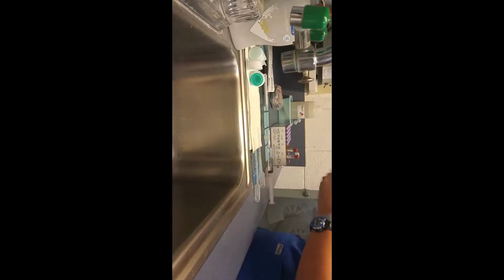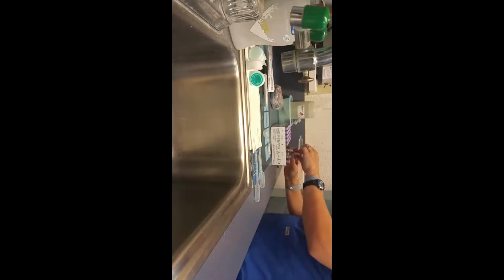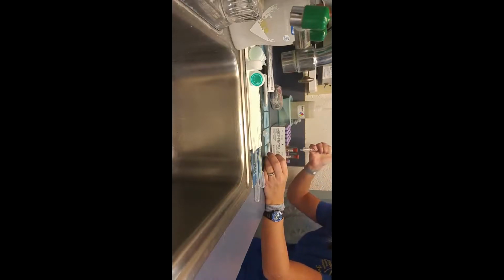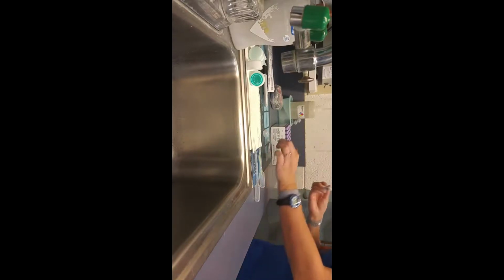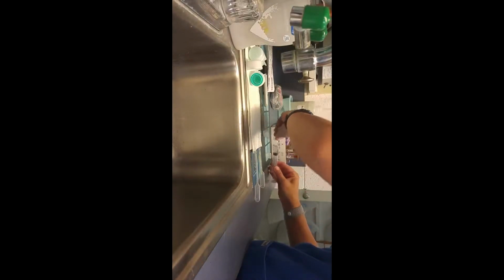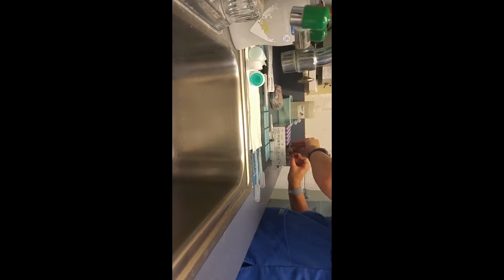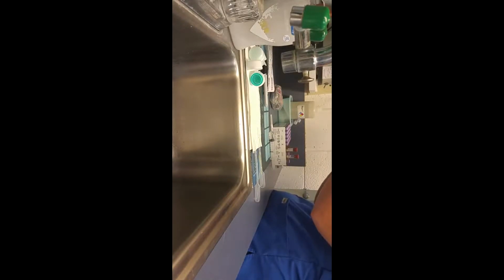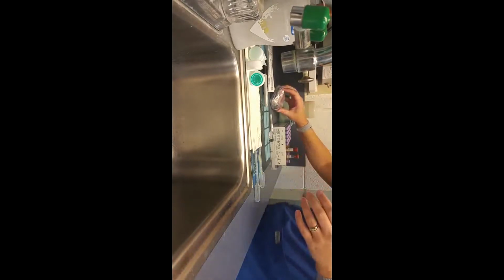We'll go ahead and fill those up again. And this will be the last time that we wash them. So we're going to wash number 3. Set them back in here for another minute.